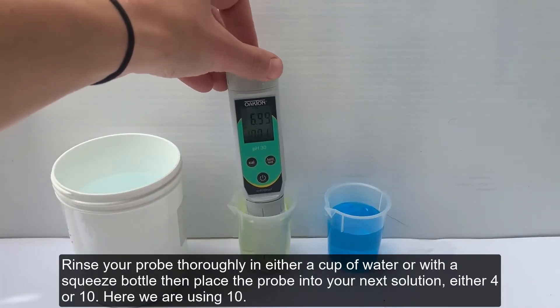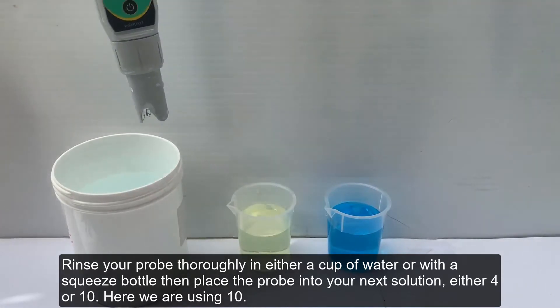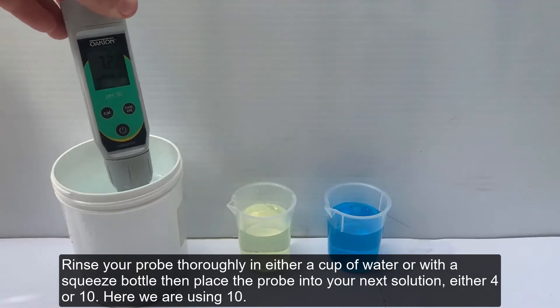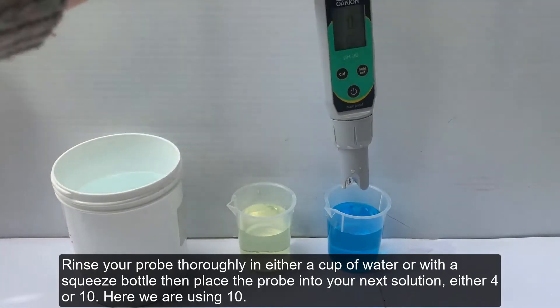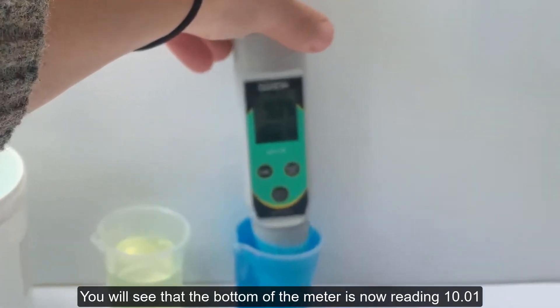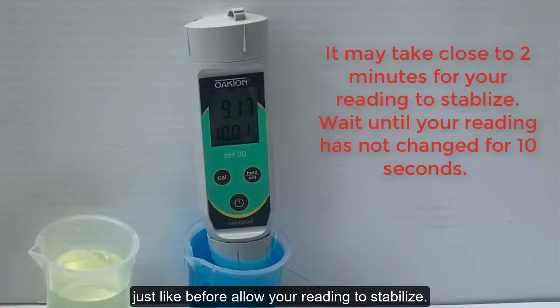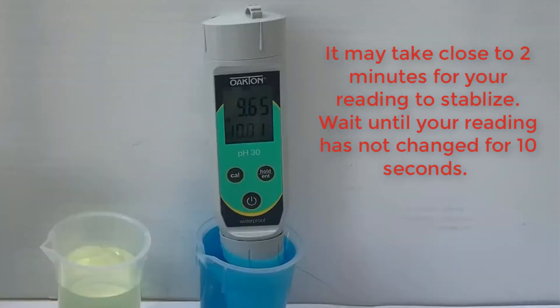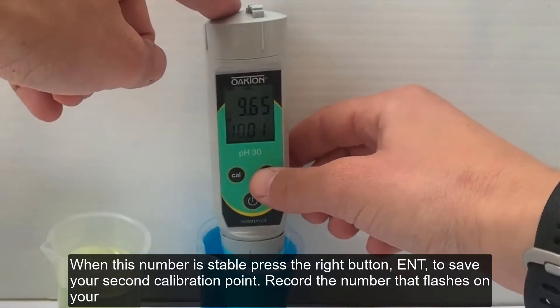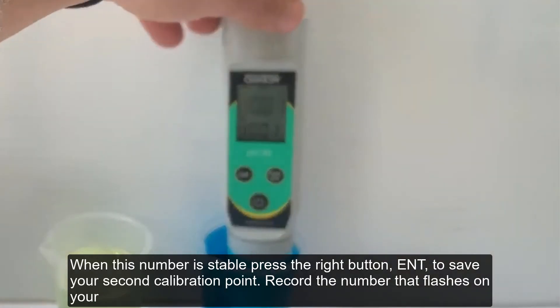Rinse your probe thoroughly in either a cup of water or squeeze bottle, then place the probe into your next solution, either 4 or 10. Here we're using 10, so you'll see that the bottom of the meter is now reading 10.01. Allow your reading to stabilize, and when this number is stable, press the right button, ENT, to save your second calibration point.